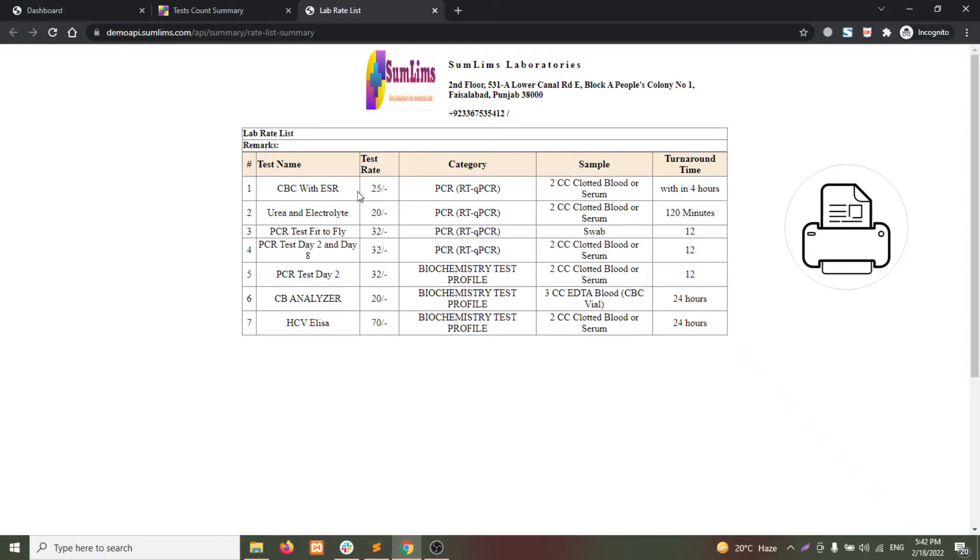This page will show you the test name, the rate, the category, sample, and turnaround time.